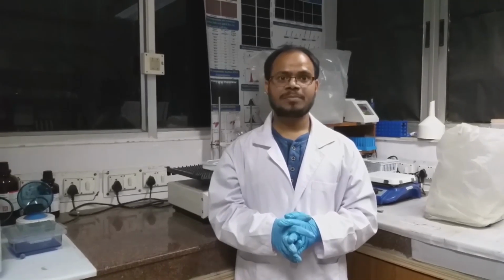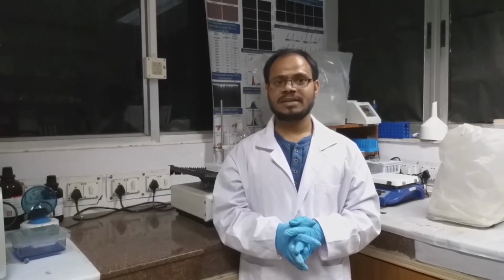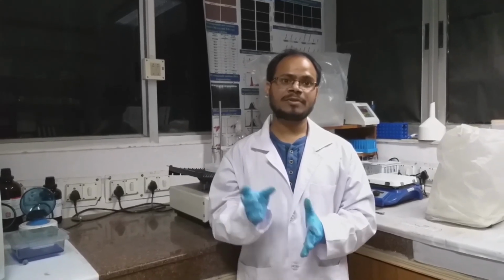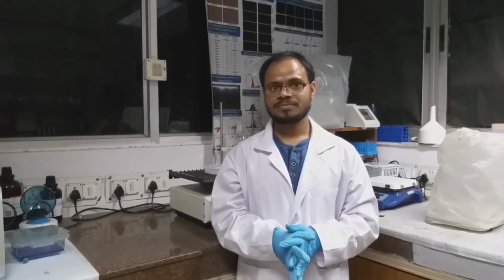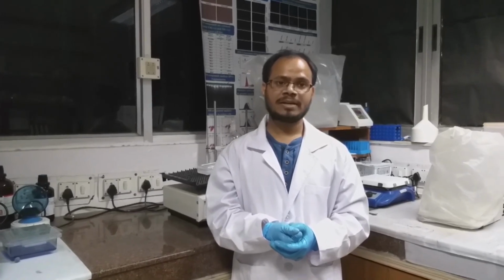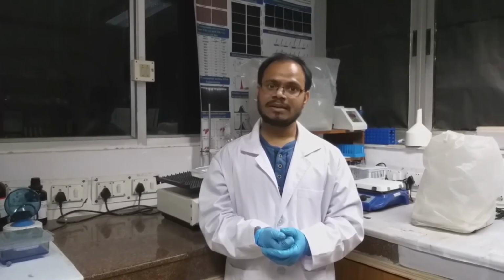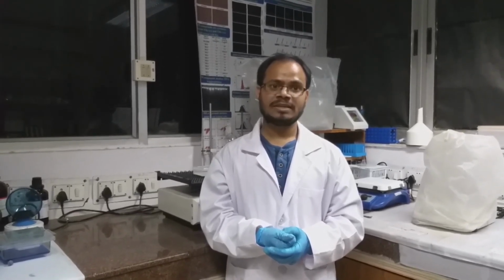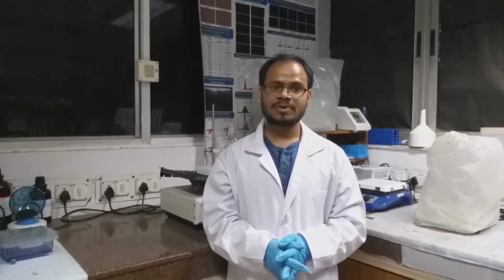After the blocking of the membrane, we remove the membrane and incubate with the primary antibody without washing. The main purpose of the blocking is to occupy non-specific sites other than the respective protein, so that when the antibody comes, it binds to that specific protein and gives no noise. We incubate with the primary antibody overnight at 4 degrees Celsius, then wash 3 times, at least 15 minutes each, with TBST or PBST buffer.